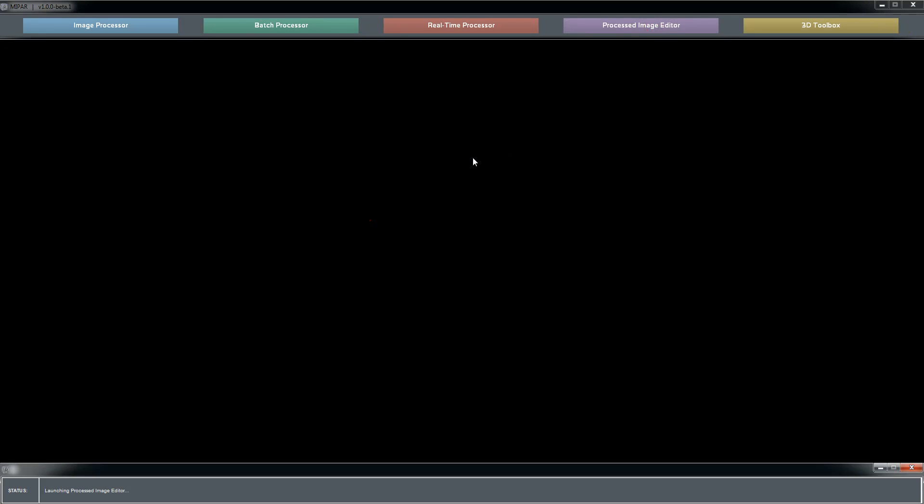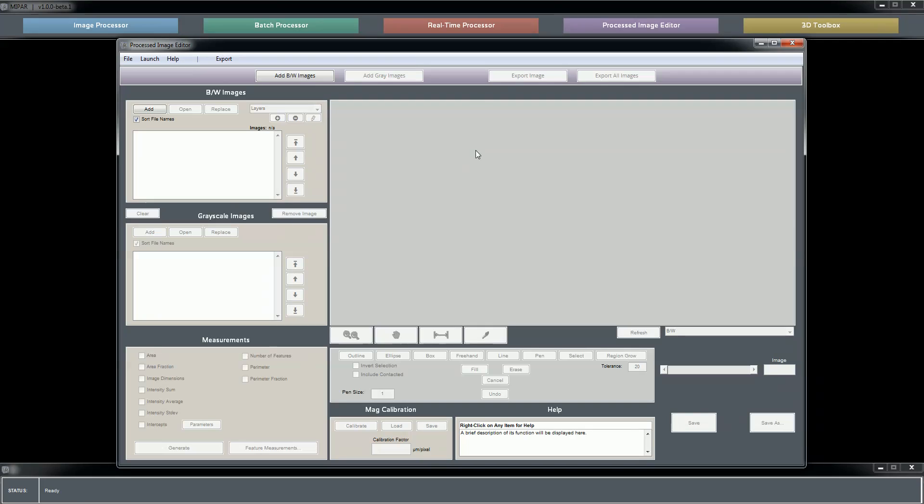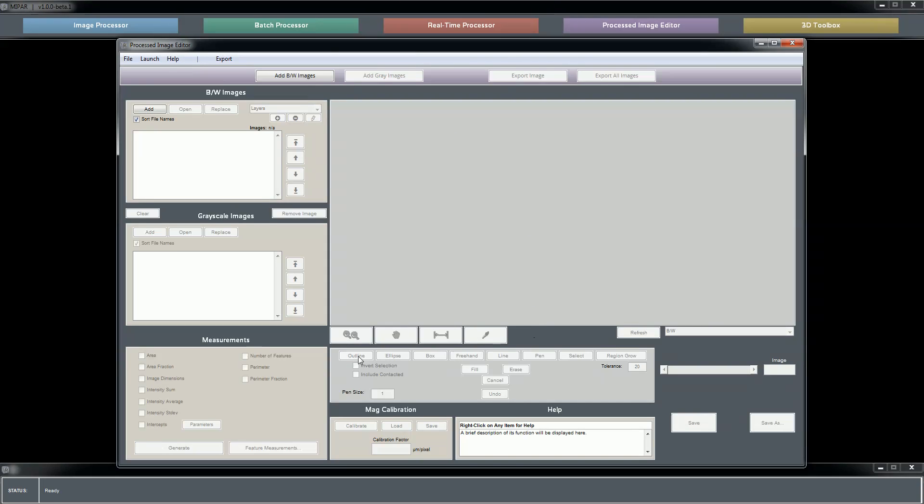The processed image editor - we'll take a quick look at that. Again, shortcut bar, common actions, menu bar. Here's where your processed images get loaded in, your original images are shown to you overlaid or in other modes over here, making manual edits.